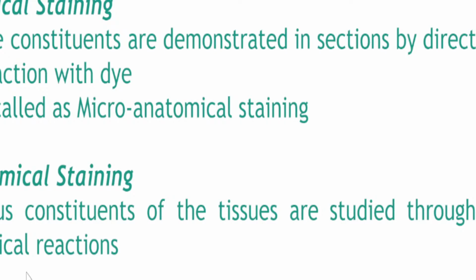It gave three types of dyes: Perls Prussian blue, periodic acid Schiff, Congo red. And the last one that she sent was monoclonal antibodies with fluorescein dyes. Which do you think is the most specific?